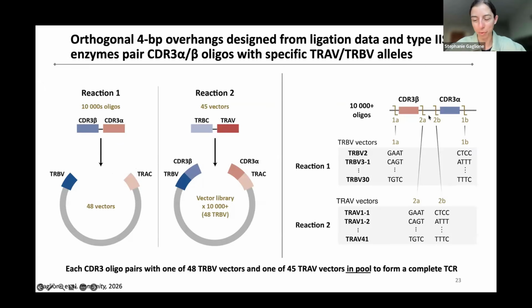And the little trick that we realized when we did the first experiments and said, oh, this is definitely going to work, is that in series-based Golden Gate reactions, a single mispairing event results in an incorrect product. If I were to try to link 15 things in series and one mispairing happened between 2 of my overhangs, I wouldn't end up with the product that I want, but I would potentially end up with something that transforms, that produces a product nonetheless.